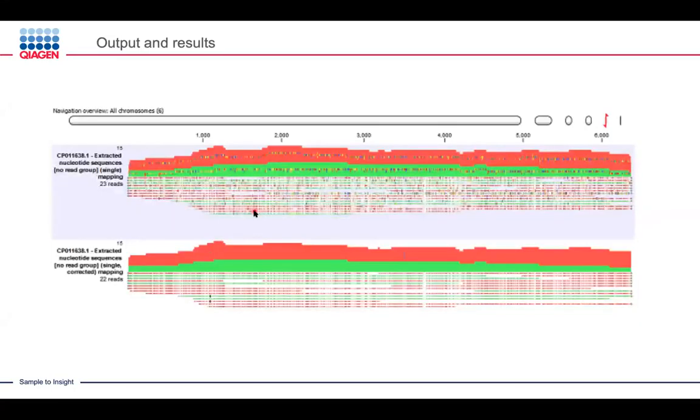Now, I always like to have an output. As I mentioned, today our goal is really to do some long read assembly and use some short reads to help polish up the assembly. I always like to give you a sense of the result, and the screenshot didn't come out as good as I was hoping, but what we can see in this top read map or assembly are all of these different tick marks in the red and the green area. These represent errors within the genome or mismatches in the read. So this is actually an example of that assembly without doing any error correction.